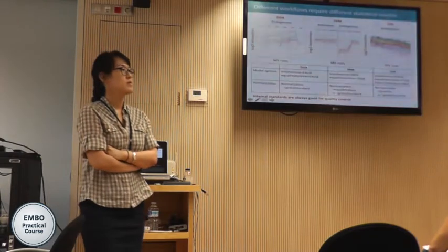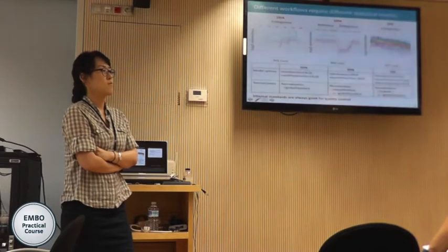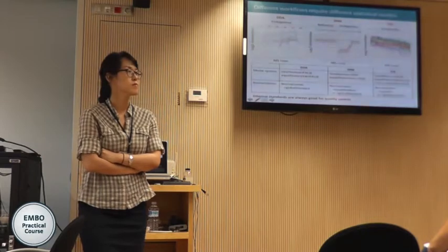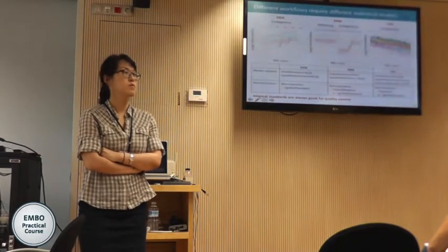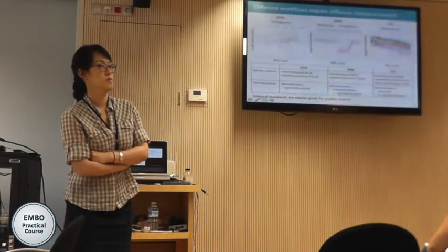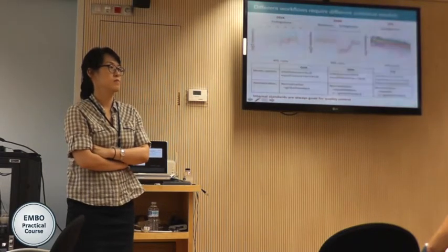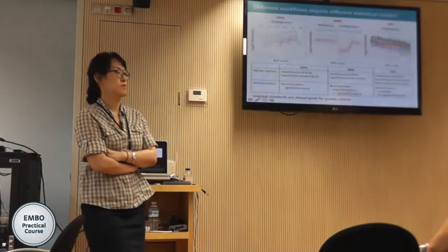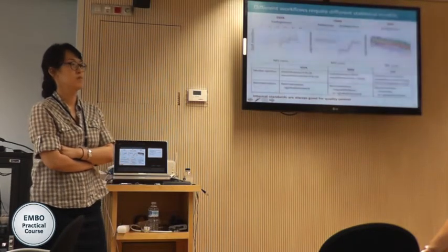Right. So the question, if you haven't heard, is quantile normalization versus global standard normalization. There are pros and cons for both of them. Quantile normalization was developed in the genomic literature, where you have thousands of features that you want to normalize. Usually in DDA, we have a smaller number of features, so it can overcorrect some of the systematic effects. Especially if you have a reasonable proportion of things which are actually affected by the stress, it can remove some of the true effect.